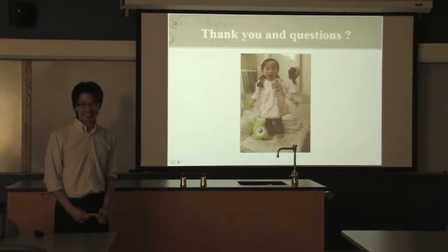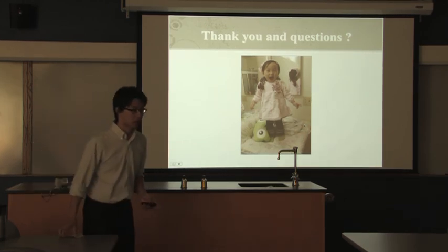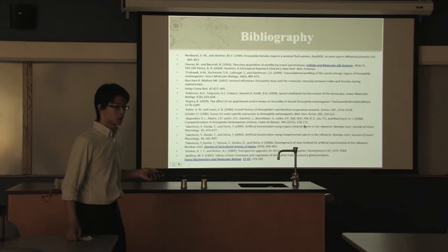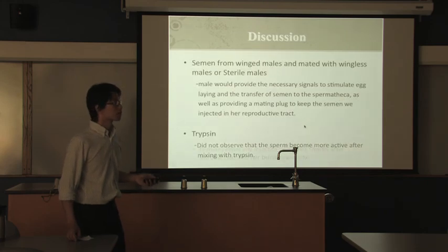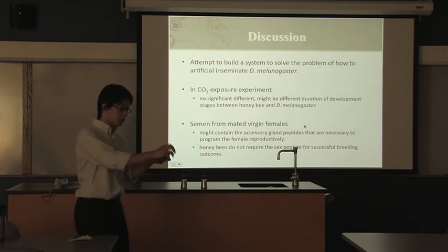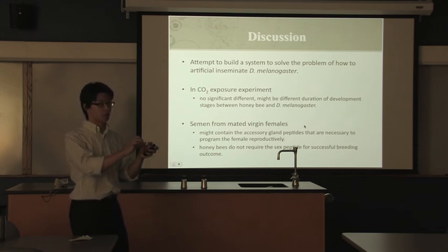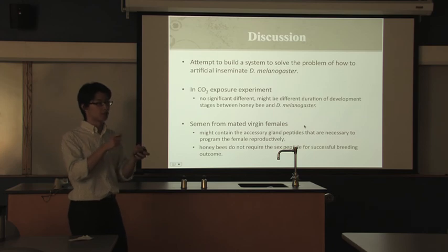All right. Any questions? How long did you leave the pipette inserted in the female when you injected the semen? Was it just introduced into her like the video showed? After we introduce the semen into her, we pull it out immediately. But we need to pull it out very carefully because sometimes the sperm is very long and may attach to the tip of the pipette. So we should be very careful.